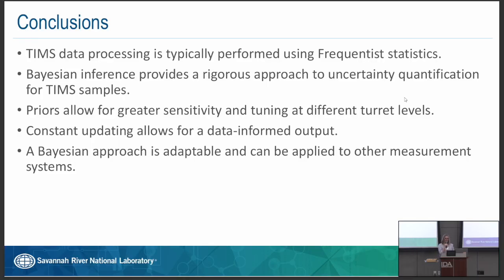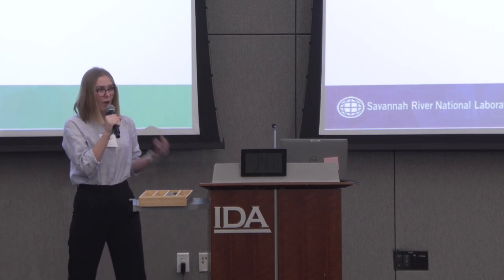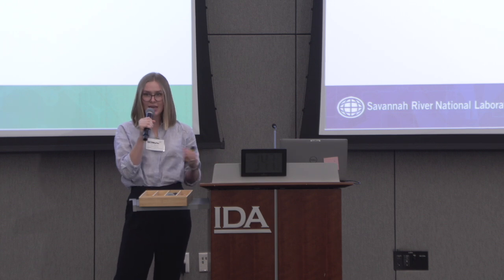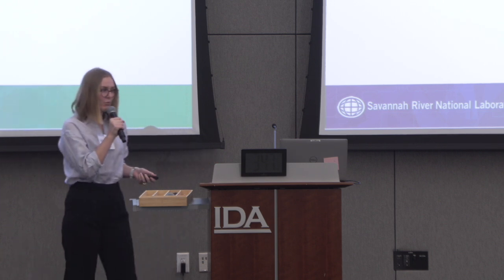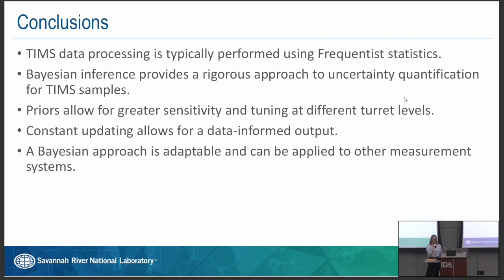Some takeaways, again, we still think that a frequentist approach is a positive thing for practitioners to use, but why not introduce a more rigorous approach to uncertainty quantification to complement that? Priors allow for greater sensitivity and tuning, and we have that constant updating.